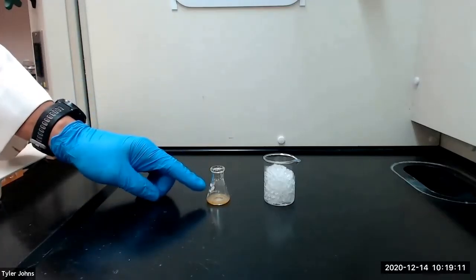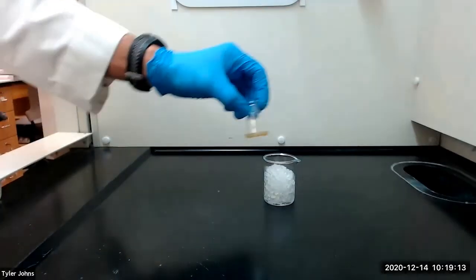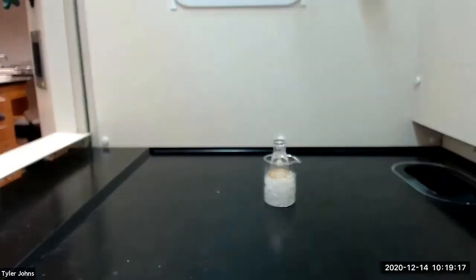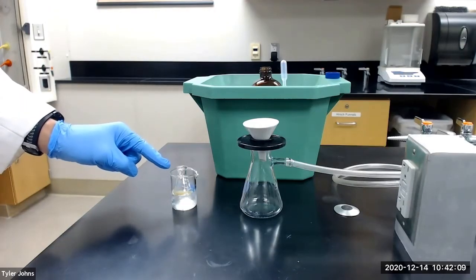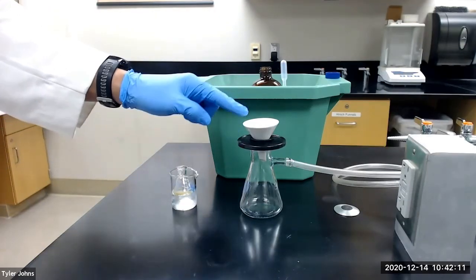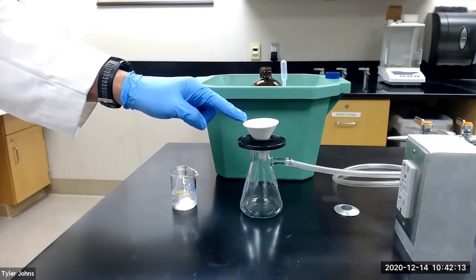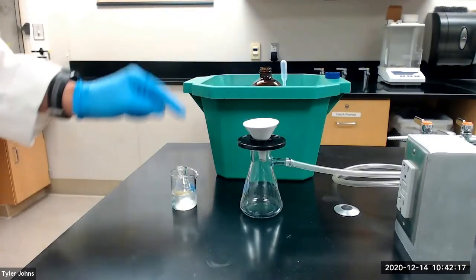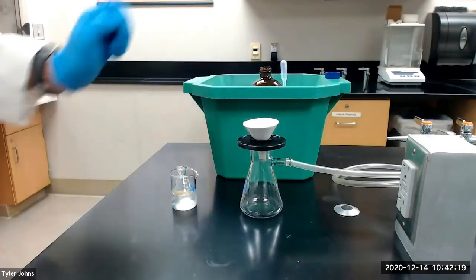After cooling to room temperature, we will place the Erlenmeyer flask in an ice bath until crystallization is complete. After crystallization is complete, we will use vacuum filtration with a Hirsch funnel to collect the crystals, and we will use ice cold 95% ethanol to aid in the collection and washing of the crystals.